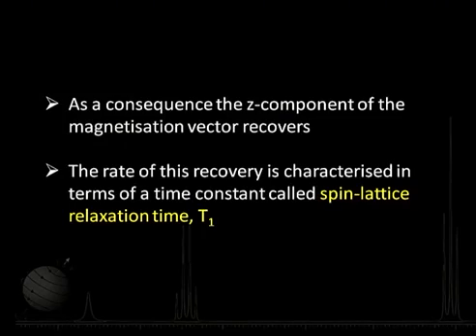And then this recovery is characterized in terms of what is called the spin-lattice relaxation time. This is a very, very crucial parameter in the context of NMR, which we probably will not be using much, but we need to understand it, because this is what is going to determine the way the NMR spectrum looks.